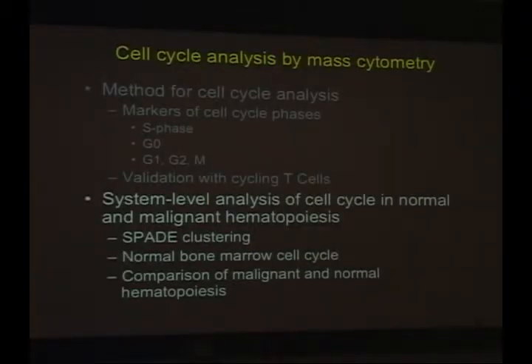So now we've essentially defined how to determine the cell cycle state with as few as 4 markers, one of which actually doesn't use up an antibody channel. And so that leaves you a lot of other markers to do whatever other biology you might be interested in.